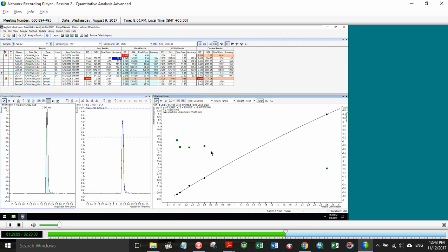Okay. In Quant with QTOF, is it more usual to use an internal standard, or, as in the case of a UV detector, not to use one? Using an internal standard and not using an internal standard, there are several methods that are available to us for quantitation. We had the question just a few minutes ago about the method of standard addition. The method of standard addition is a very accurate method for determining the concentration of samples because you're taking into account any matrix effects.